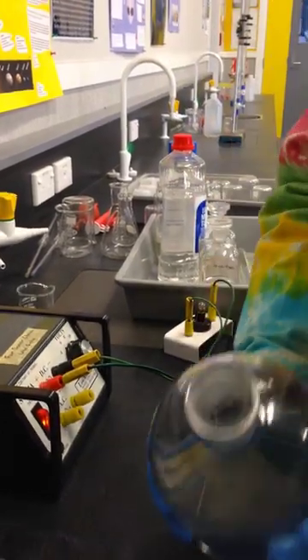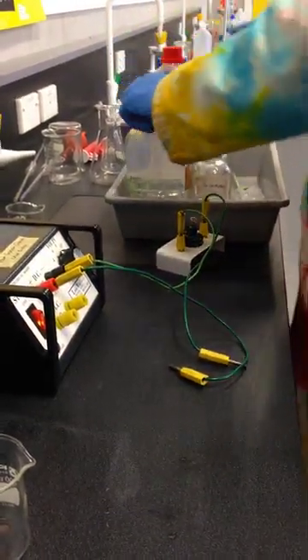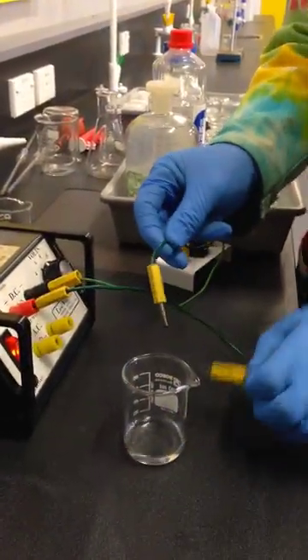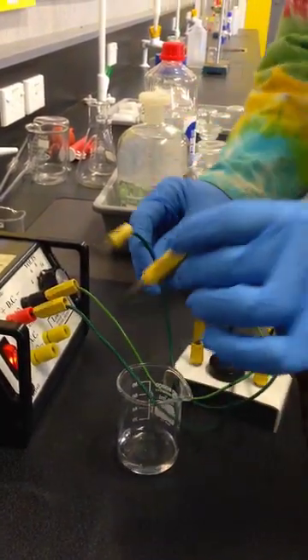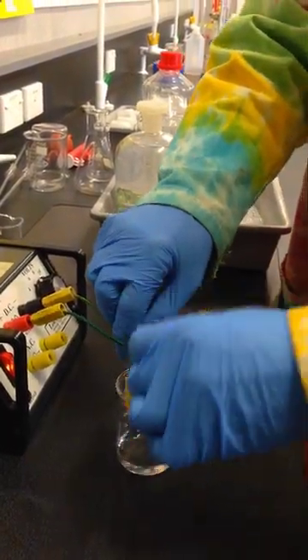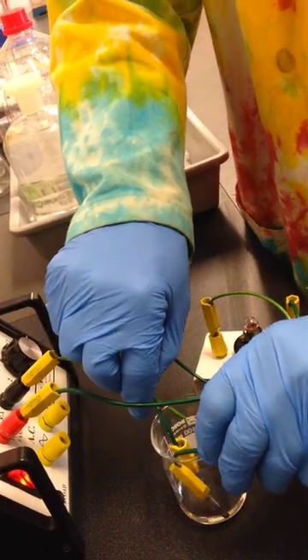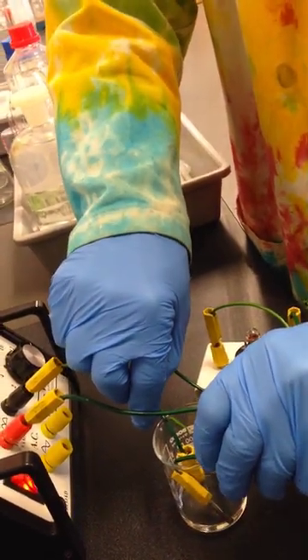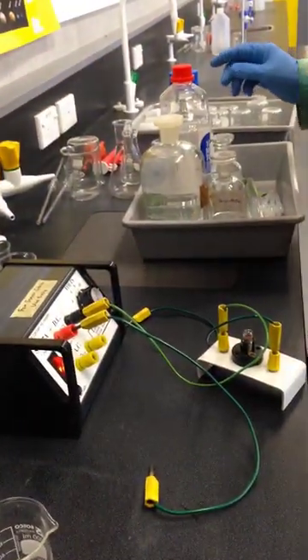Ethanoic acid, so the vinegar, acetic acid, it used to be called. Again, if I put the electrodes into the ethanoic acid, we don't get any electrical conductivity at all. The light bulb doesn't glow. So none of these substances so far have conducted electricity.